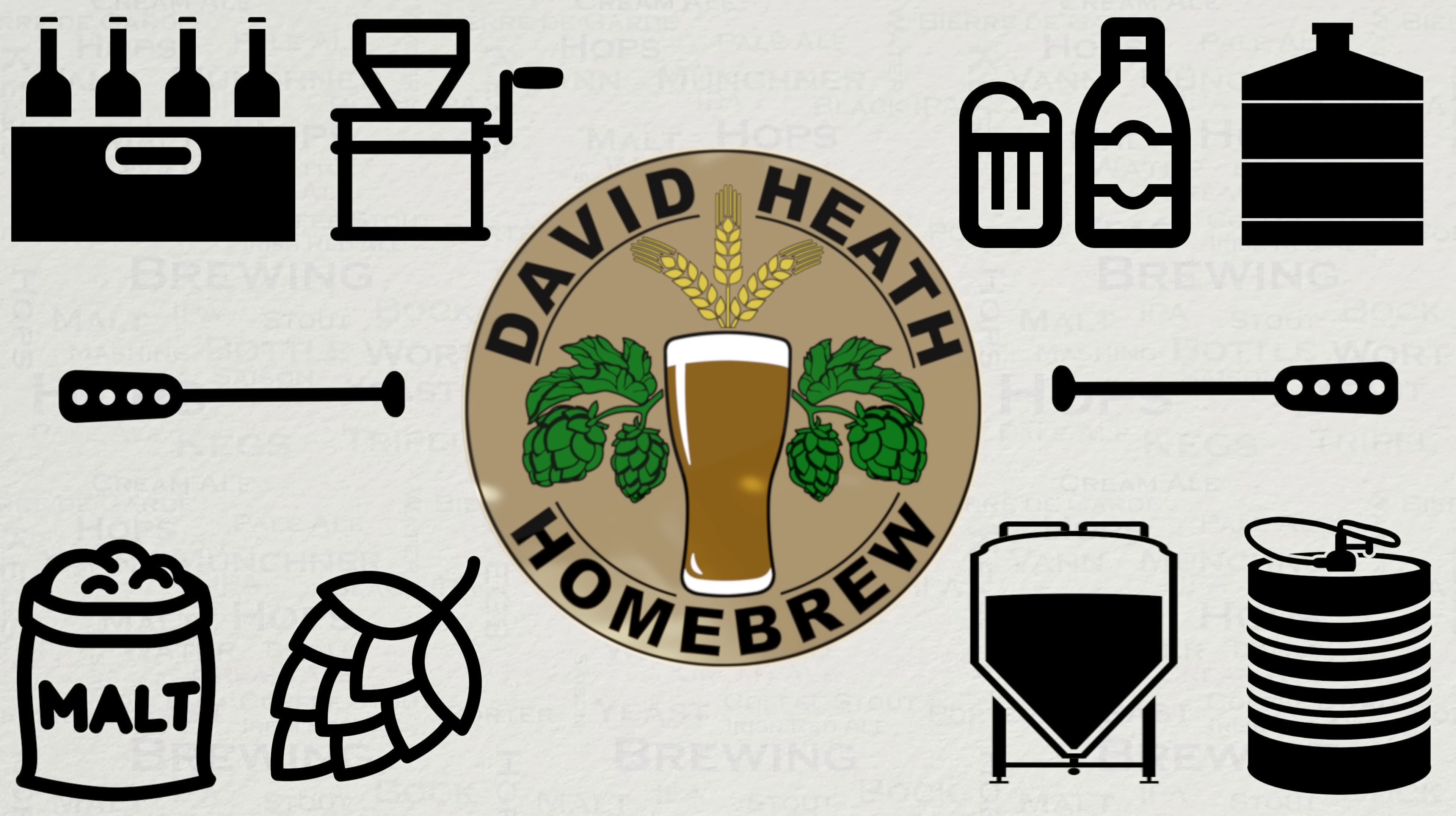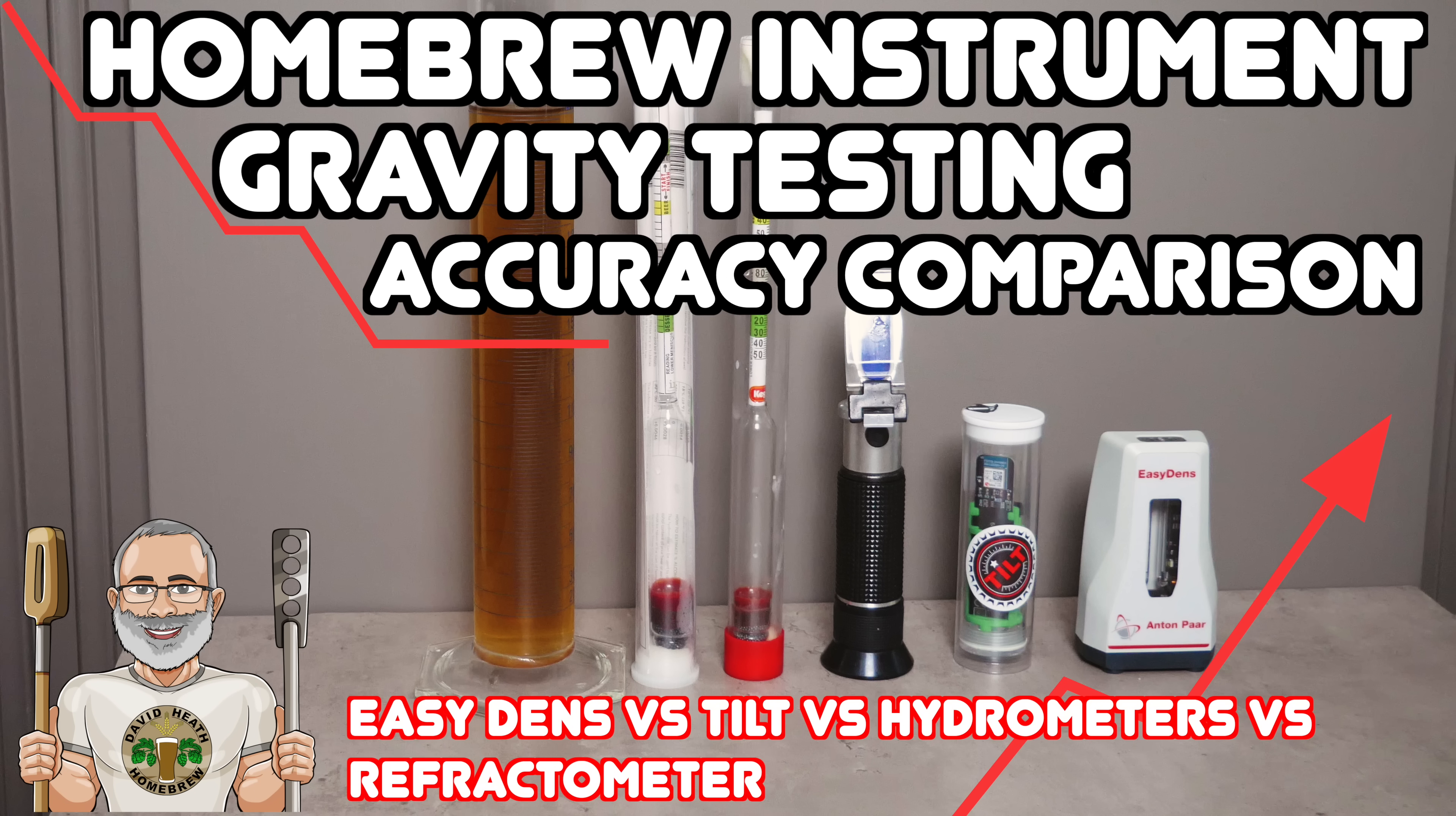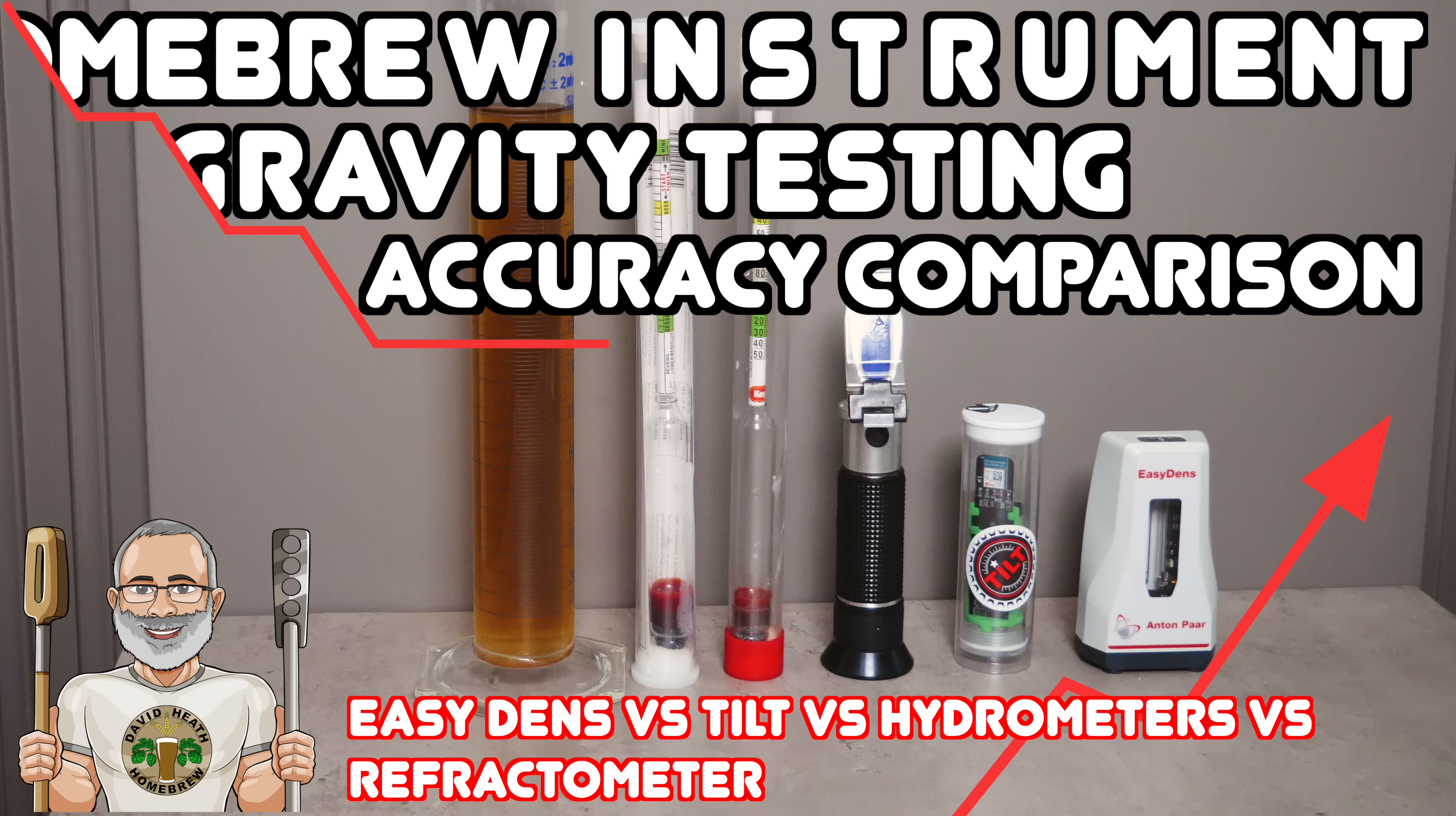Drink beer. It's good for you. Hello and welcome to the video. Within this video I'm going to be testing and comparing a wide range of gravity measuring products with exactly the same wort to see how they compare in terms of readings and accuracy. I will be sharing the whole method so that if you wish to you can follow the same test at home yourself. So let's get started.